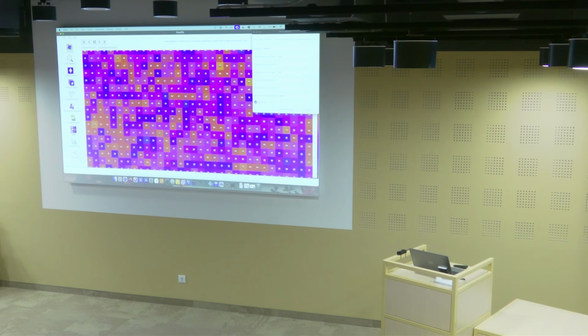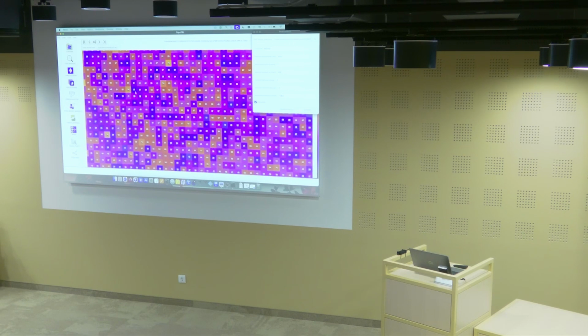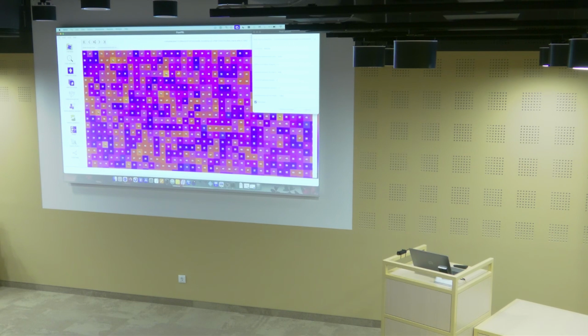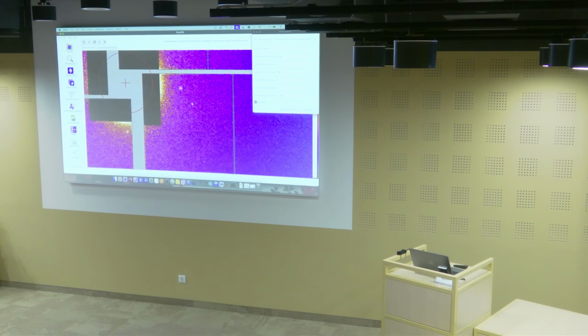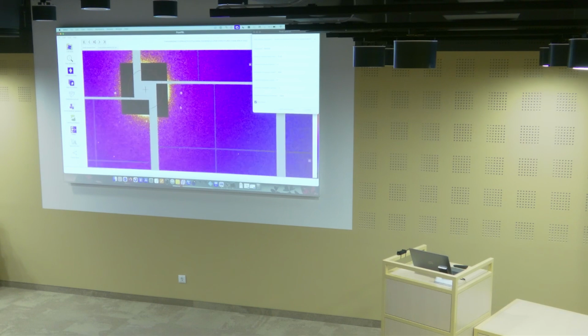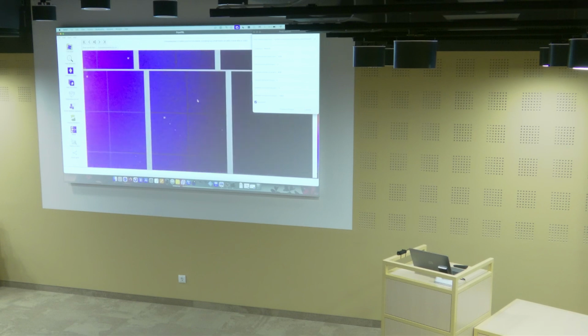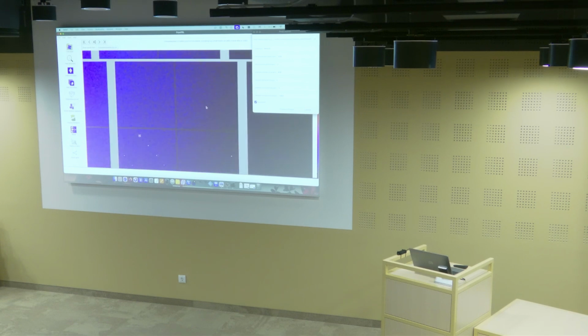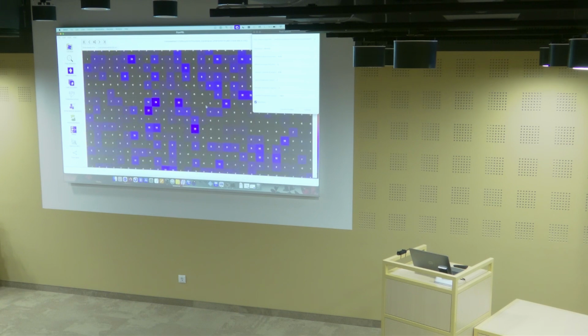So we can see here that the background, at least in this center, goes to like 60, 70, and so on. But here in the middle we have a very high background because of probably the medium that was used for the crystals. So if we zoom in over here, we will find much lower values.